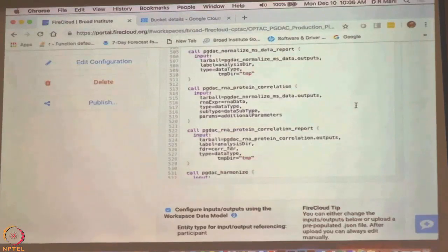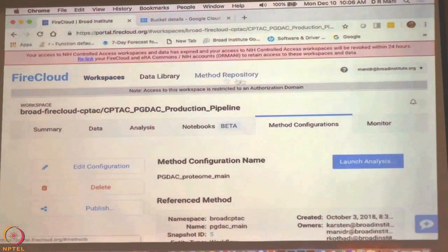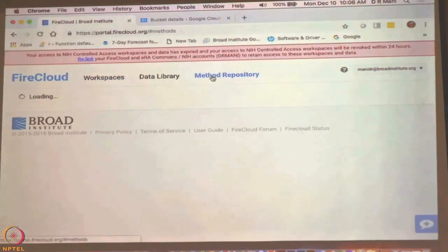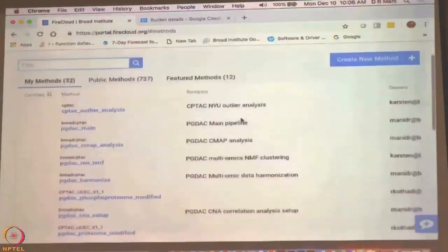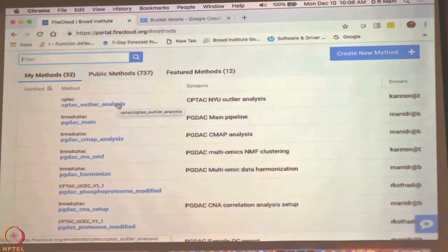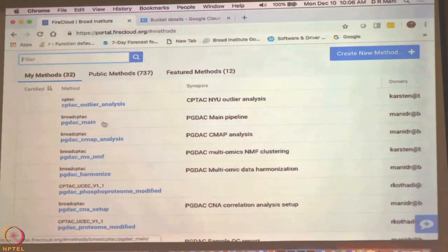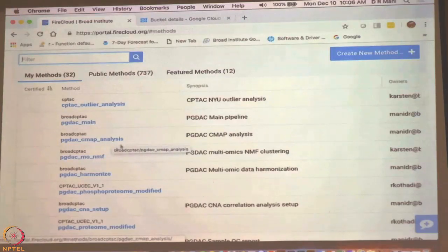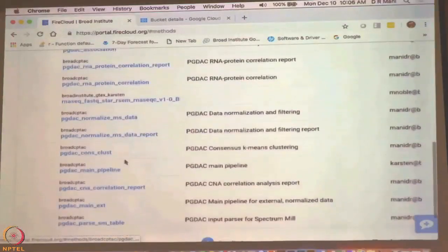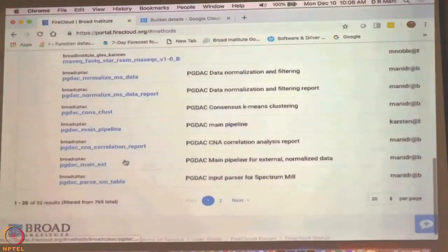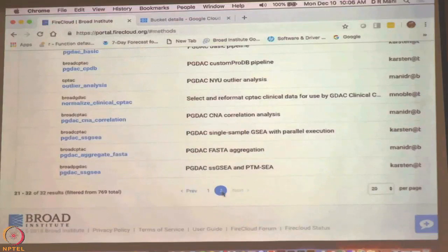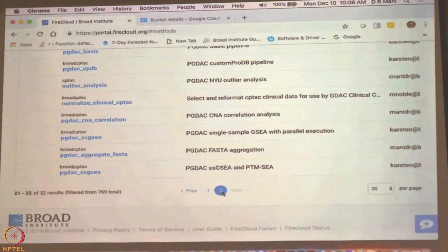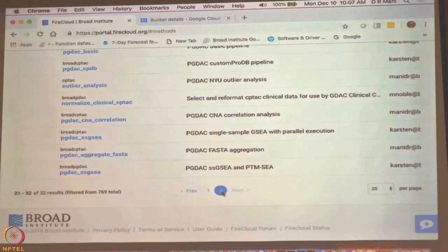The method repository has all the methods that we have generated available — all the pipelines and workflows. There is outlier analysis from David Fenio and Kelly Ruggles' lab available here. There is also the main pipeline, the connectivity map analysis that was reported in the paper, and many others. I think Karsten's PTM SSGSEA is also somewhere here. All the methods are here and you can use any of them. When you create your workspace, you can import any methods you want, put your data there, and apply the methods to that data.